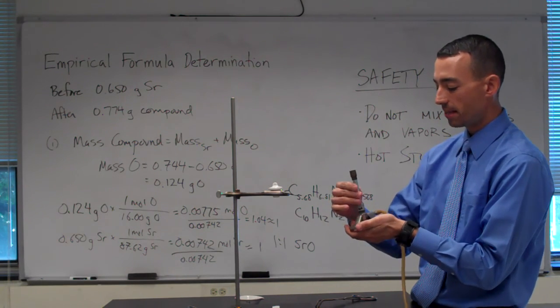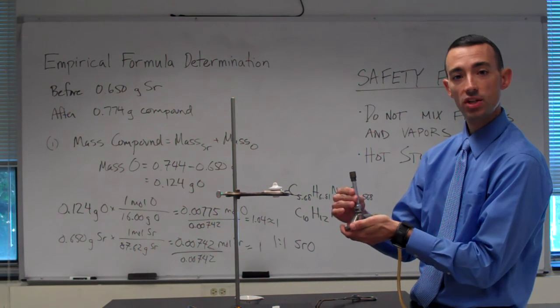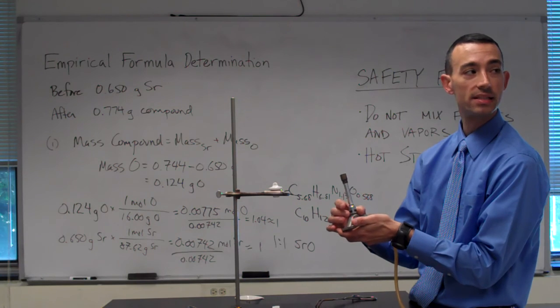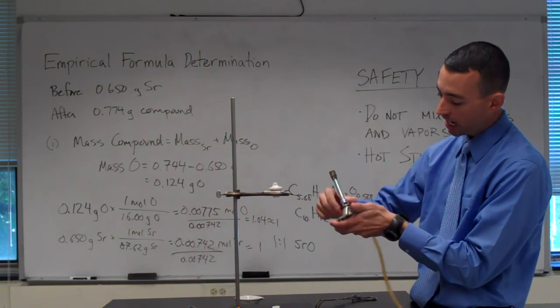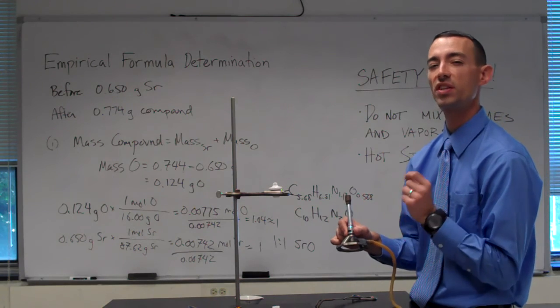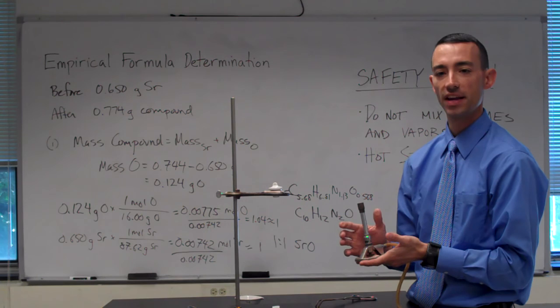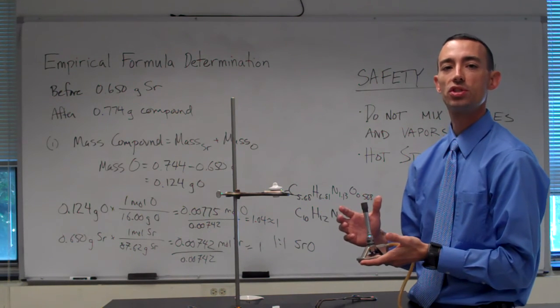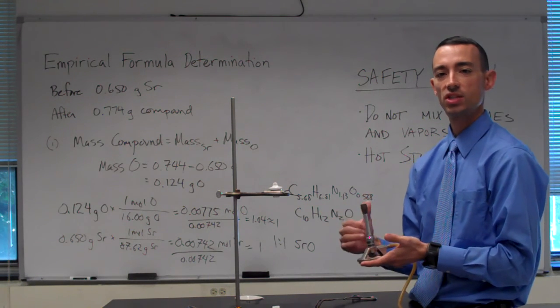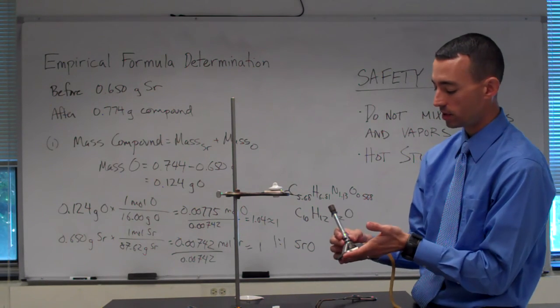The stem, the actual burner itself, turns on its base. And this adjusts how much oxygen is allowed in through the vent at the bottom, which controls the temperature of the flame. If you've used a gas stove, you notice that your flame is usually blue. That's due to the amount of oxygen that's reacting with the natural gas or propane, depending on what you would have.